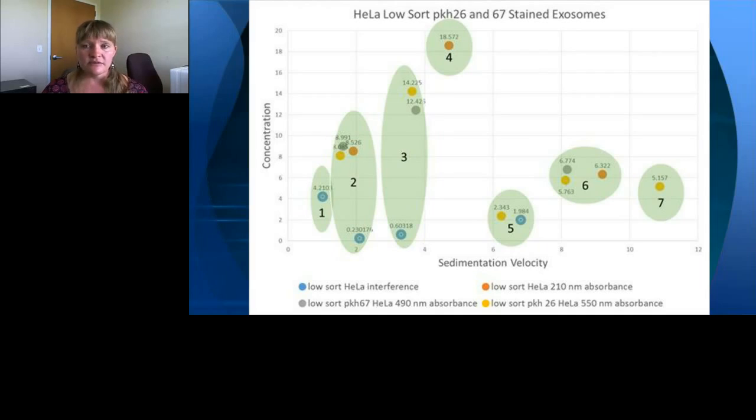As you can see from this particular location, we have several different groupings. Some, for example, this one, only have lipids, so you could think about that as perhaps a lipid contamination. You have some that are only dyes, which could be your dye aggregation. So it's telling you the concentration in your sample, what is extracellular vesicles, what is probably buffer, what is dye, what is lipid. Therefore you can use those to determine how your extracellular vesicle prep or method is working.